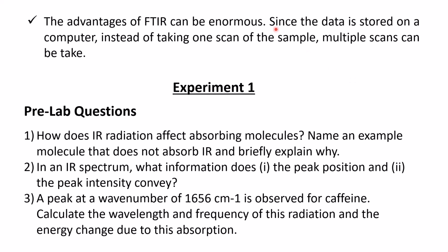Now, the advantages of FTIR can be enormous, since the data is stored on a computer. Instead of taking one scan of the sample, multiple scans can be taken at a time. So in FTIR, you can run your sample over and over. So these are pre-lab questions you need to address or look at before you perform your experiment.